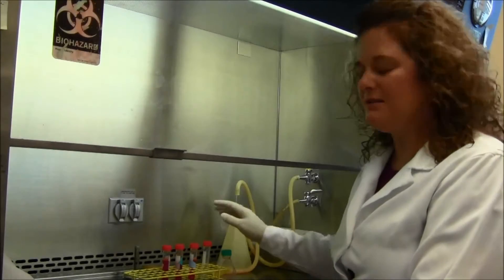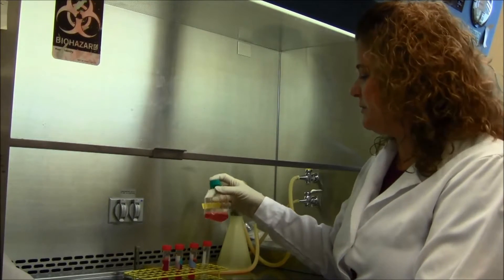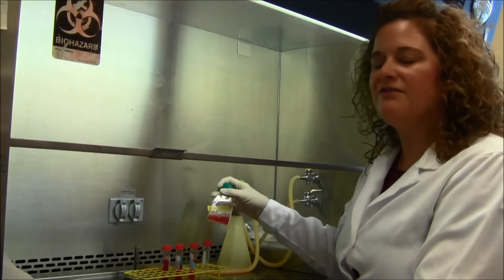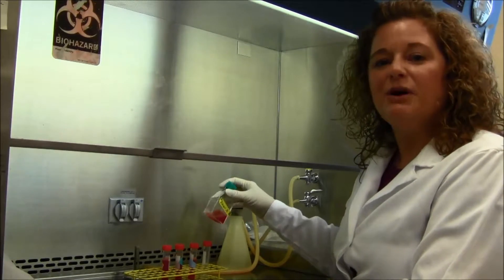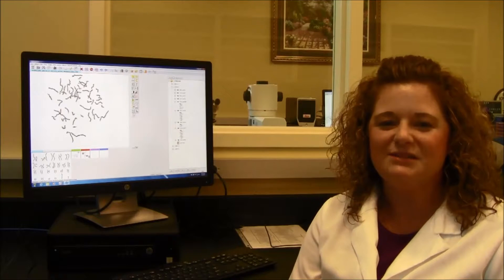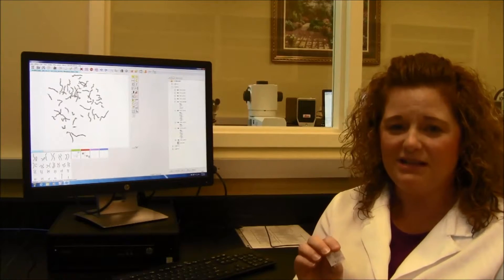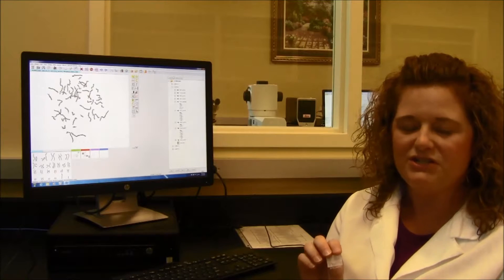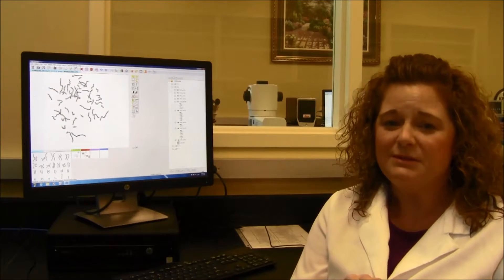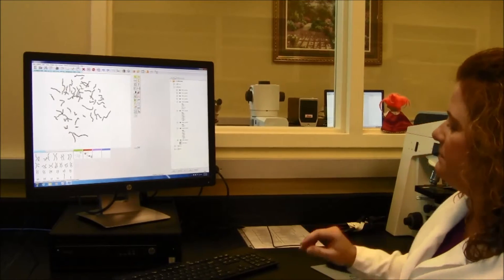Here we have obtained patient cells in metaphase and we're going to put them through a harvest procedure. At the end of this, we will have chromosomes which we will be able to analyze. After the harvest process is complete and we have obtained metaphases from the patient, we make slides on each patient and these slides are then visualized on the microscope and digital images are taken and put into our karyotyping system.